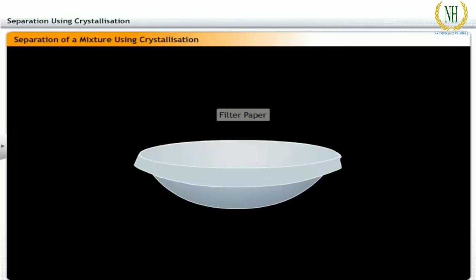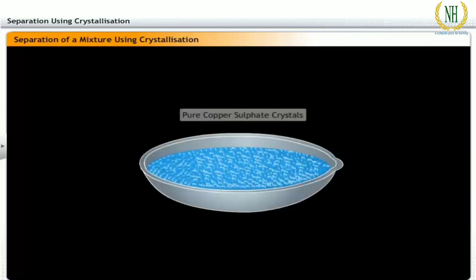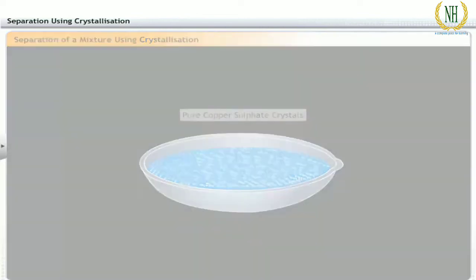Don't disturb the setup. After a day, you will find crystals of copper sulfate in the dish. This time, the crystals will be pure. This process is called crystallization. It is used to purify solids.